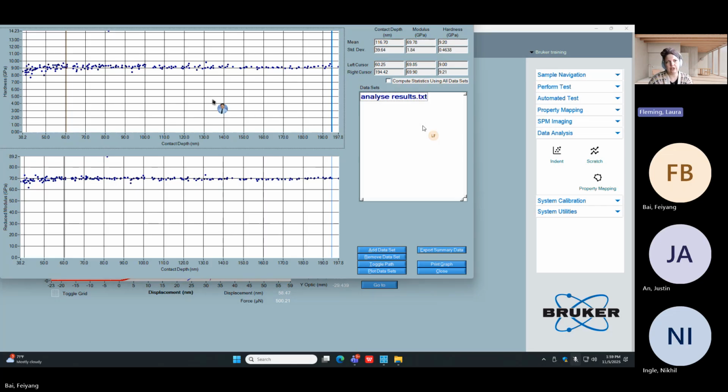And if we see a change in hardness on the fused quartz standard, we're typically looking at something wrong with the compliance. Either one, the compliance is set incorrectly, or two, something has gone compliant in the system. I specifically do not train users on how to resolve that issue, because if you see a problem with your compliance, I want you to call me.